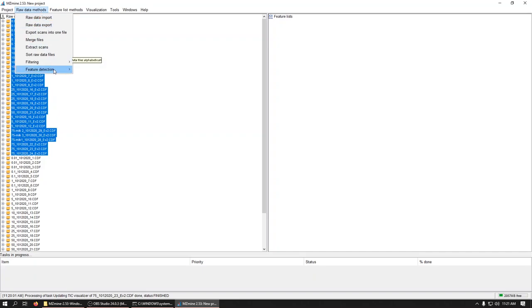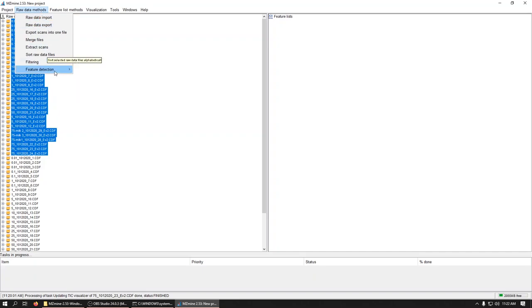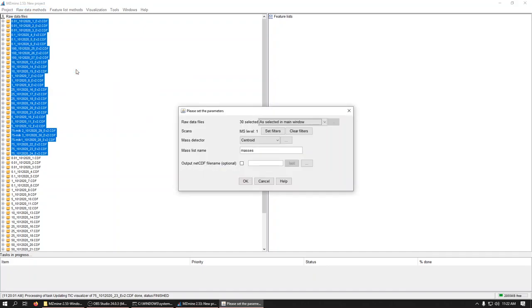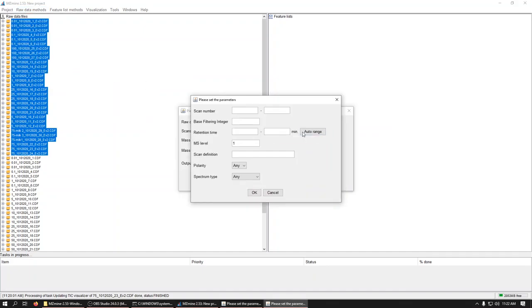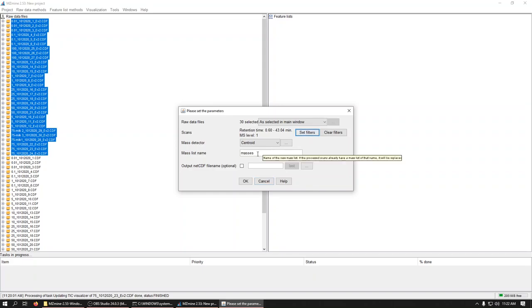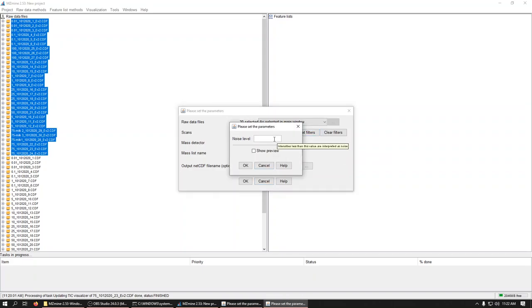Well, the next step we'll have to do is we want to detect masses. Because we want to move this over to what MZMine calls the feature list. So feature detection, mass detection. As selected in the main window. Set filters. Again, auto retention time. We're going to make a mass list name. We're going to call it masses. We'll have to go under centroids. And we'll have to give it a noise level.